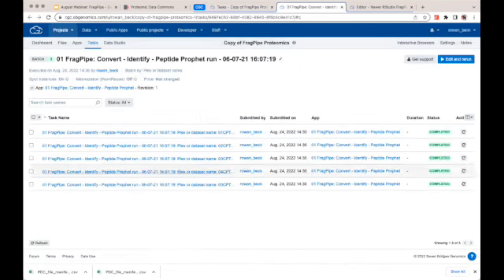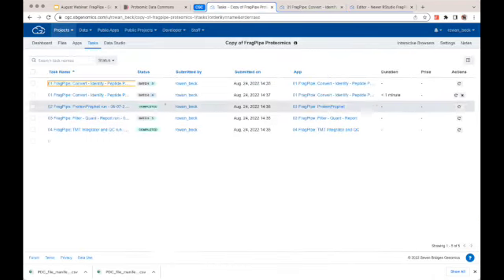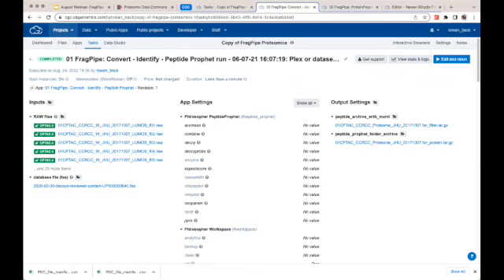Okay, and you'll see what it looks like once it's completed. You'll just have some output files. So on the left here, you'll see the input files we've selected, and on the right are the output files. These are .tar files. And then you'll go on to the next step and do the same thing. So once again, we have input files, which are the outputs from the previous step, and then we'll end up with an XML file as an output, and then so forth.